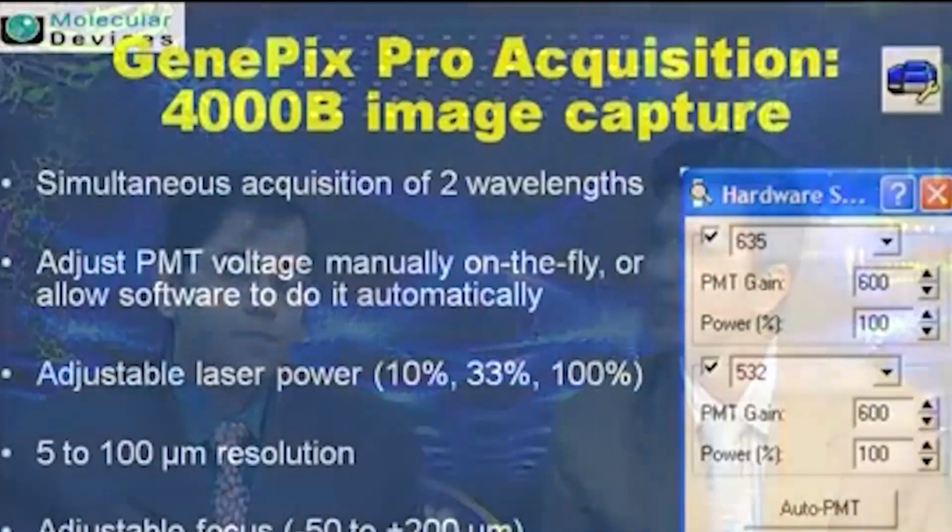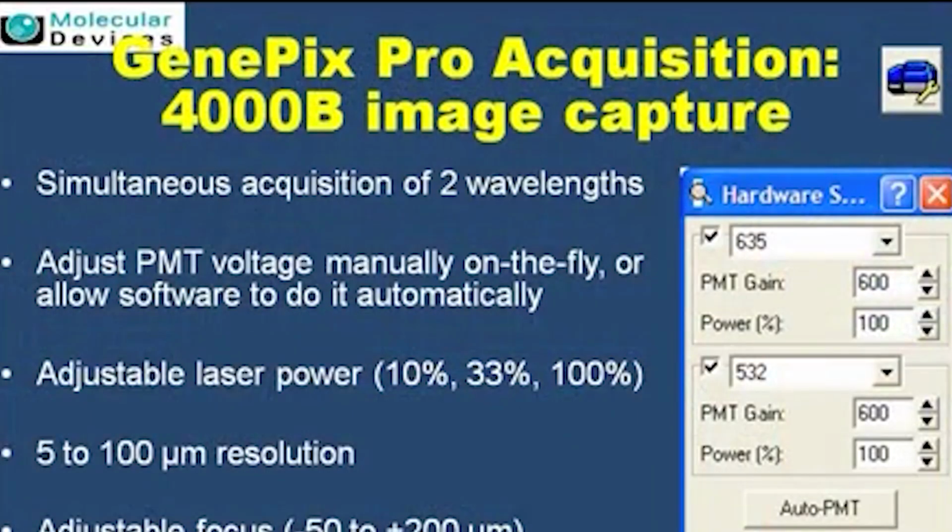Maybe we can talk a little bit about the software; I'm using GenePix Pro software, and how one can acquire an image if one has a system like the 4000B. There is a button towards the side where you have control for the scanning time. As it is a dual channel, meaning two lasers are present, you can select whether you want to use 1 and 2. Based on the user's application, you select both the lasers, and then at the level of live scan, you control the PMT and the resolution you want to use. These are all within the same software.